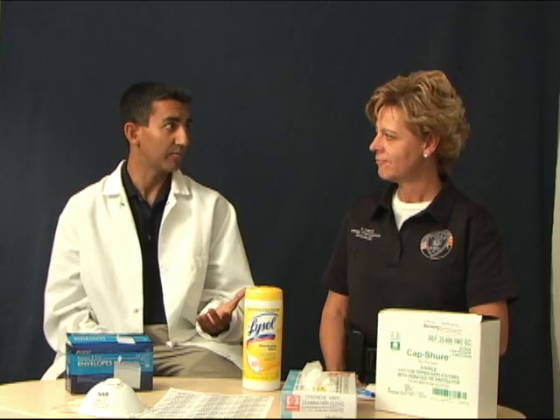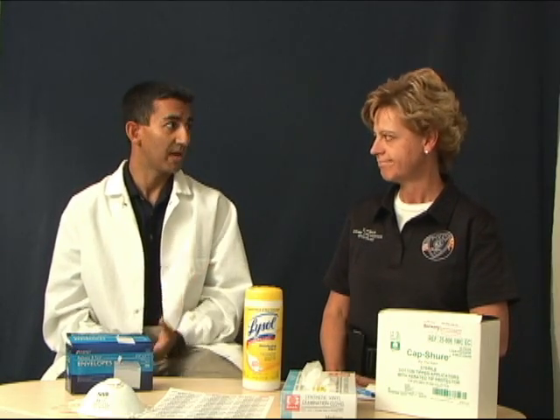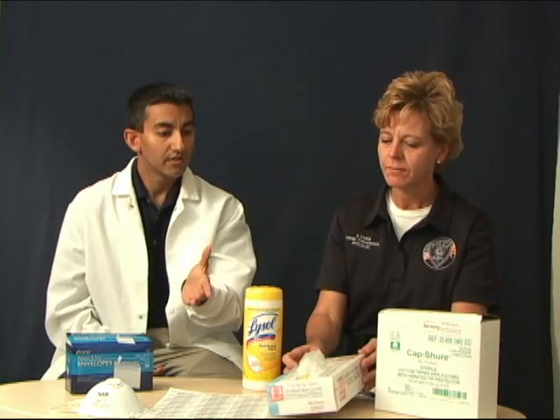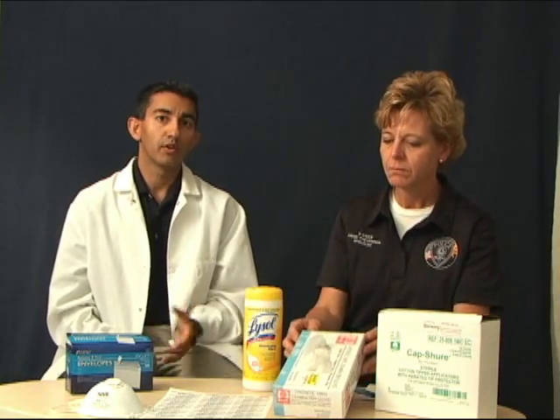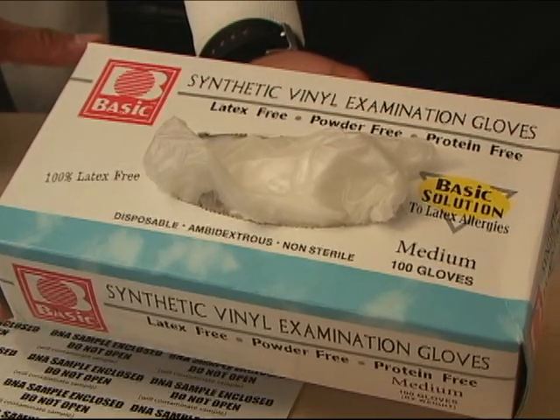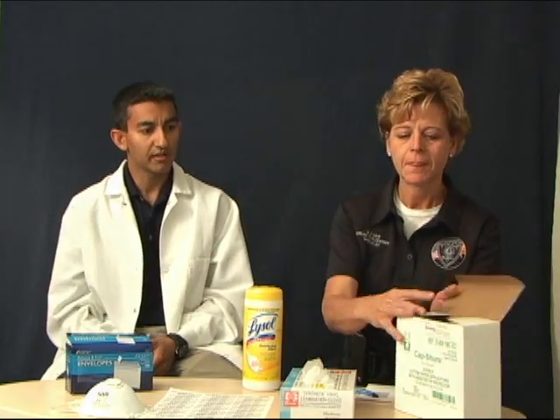Something like Lysol or disinfectant, something that will clean the area, and you'll want to do that periodically between sample taking. A mask, because you don't want to breathe on the sample, because that will also contaminate the product. You can get those from Lowe's, Home Depot, or anywhere you think of. Synthetic vinyl examination gloves work really well because some kids have an allergy to latex, and to eliminate that risk, using synthetic or vinyl gloves works really well. And what we have here is our DNA collection kit.